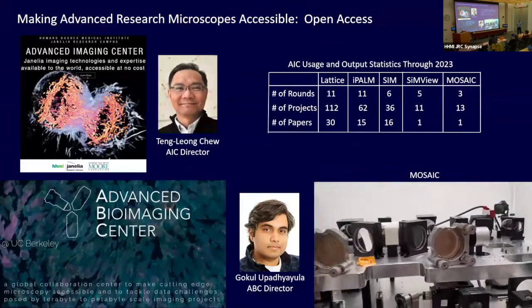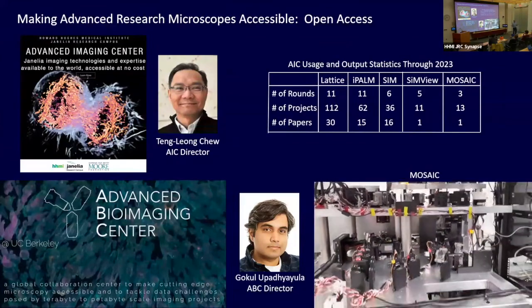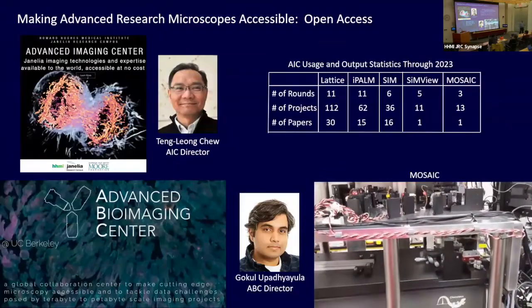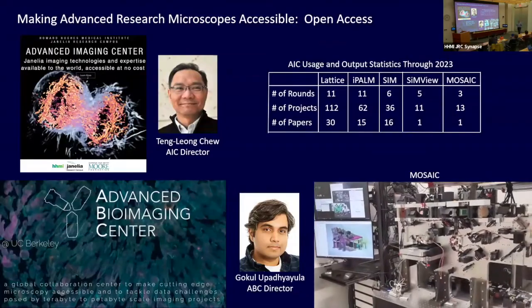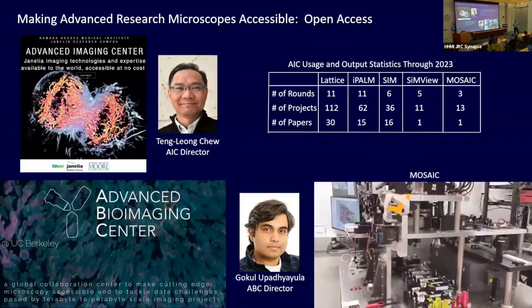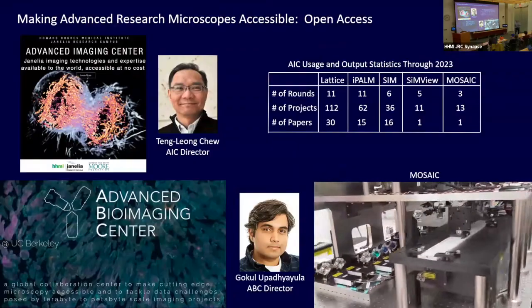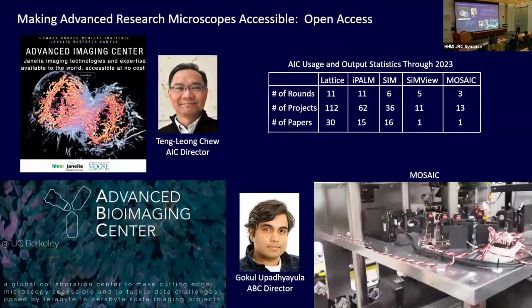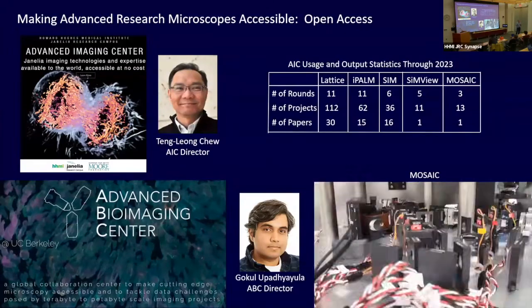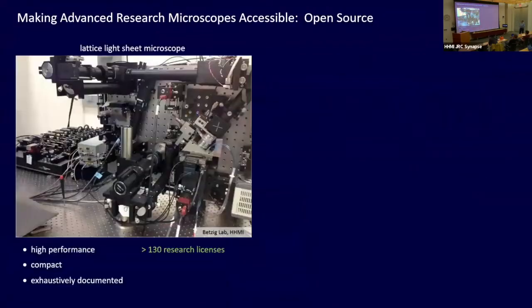And another thing that has always pissed me off, and I've worked with dozens and dozens of collaborators with my microscopes, particularly the lattice light sheet, is that oftentimes the imaging is just meant to be the cherry on the top of some biochemistry or genetics paper so they can push it into a better journal, okay? It's not central to the point of the paper. It's just there to try to get it in. You're talking to the number one cynic on earth, folks, so I'm sorry, but that's the way I view it. So you can't push many people through that way.